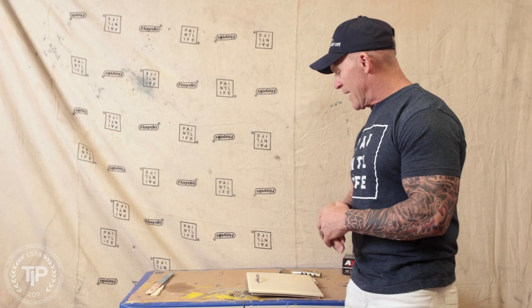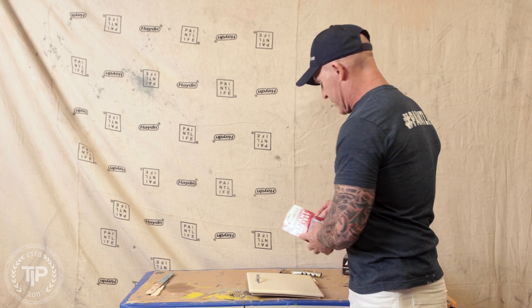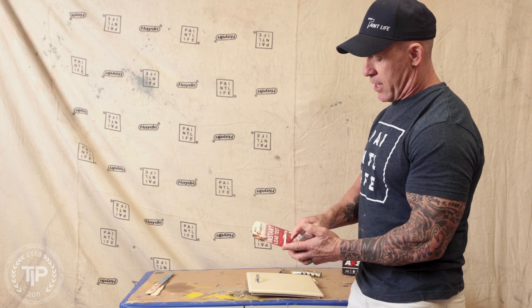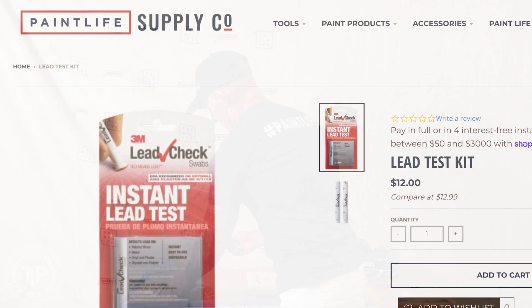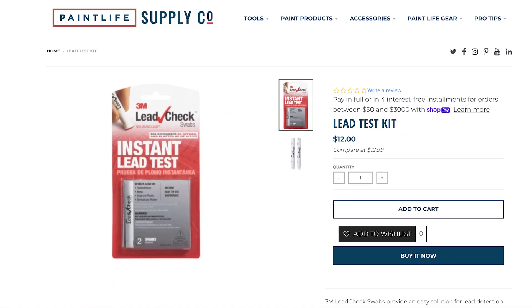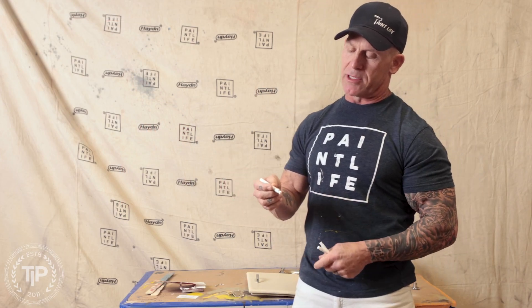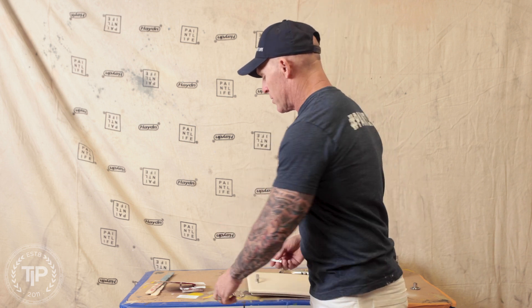All right, here we go — we're going to be testing for lead. It's a very simple, easy process. I've got my lead test kit with multiple tests in it. The swabs are very simple and easy to use. There are two vials inside each one — you break both vials, shake it up, and the liquid works its way to the end of the swab, which you then use for testing.